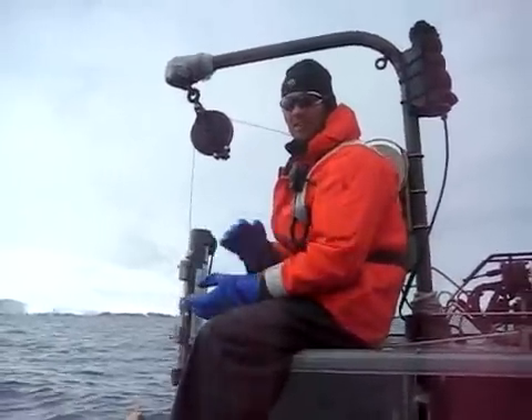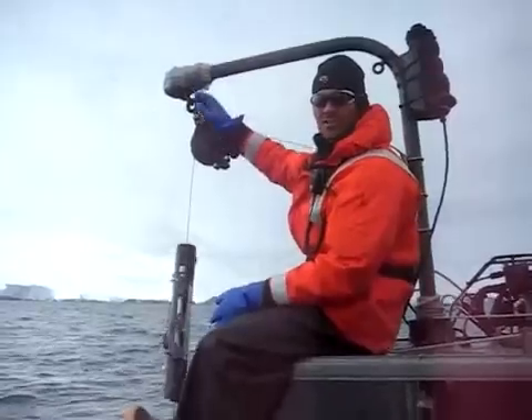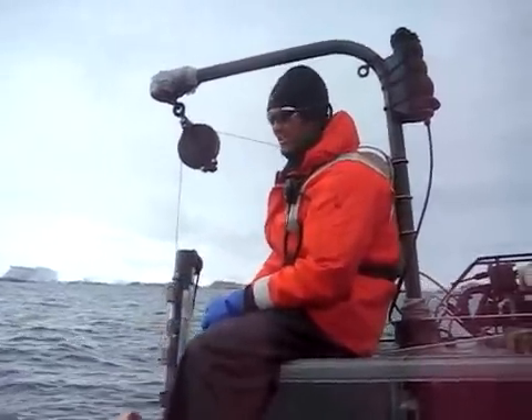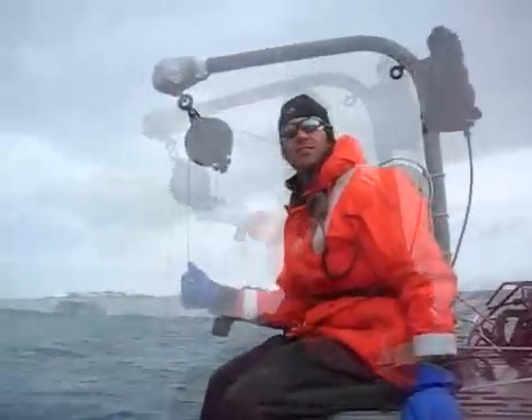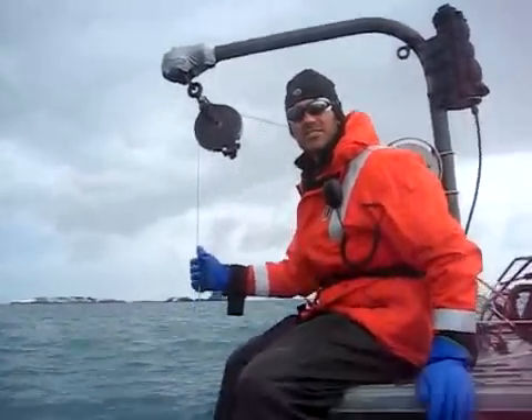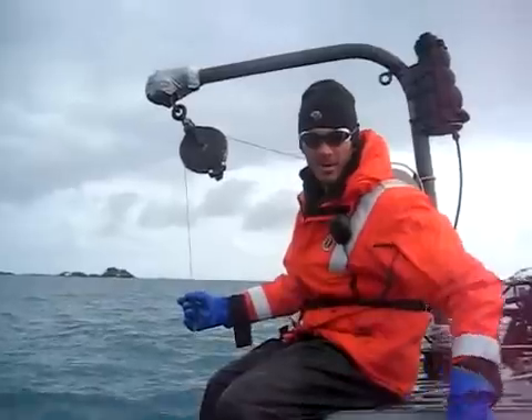So again, we have them at 50, 20, 10, 5, and then 2 at the surface, right here below us. Send her down! I can feel when the bottles are hit with the messengers — I can feel a little tug through the cables. It feels like all the bottles were hit by messengers.